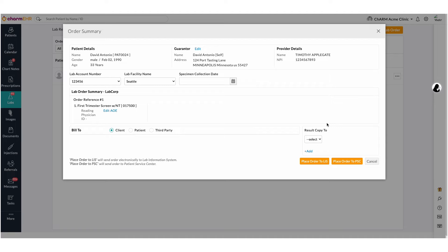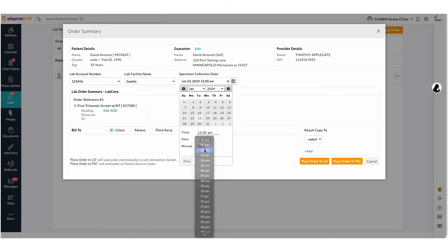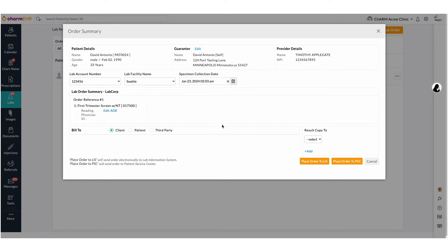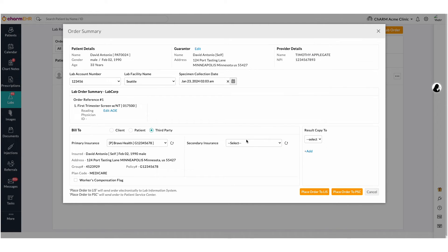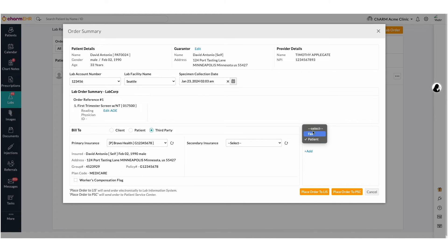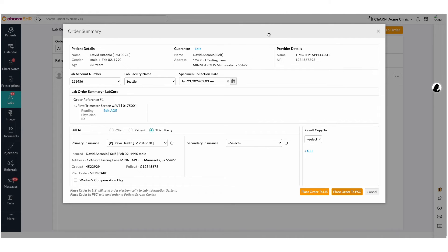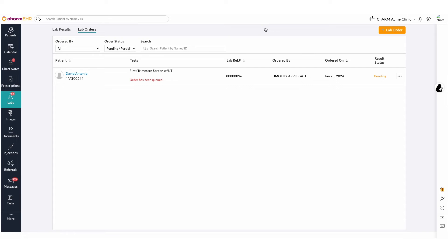This will open the Order Summary page. Enter the Specimen Collection Date and Time. Select the bill type based on the client and then place the lab order. Once the order has been placed, the order status will be displayed under the Lab Order section.